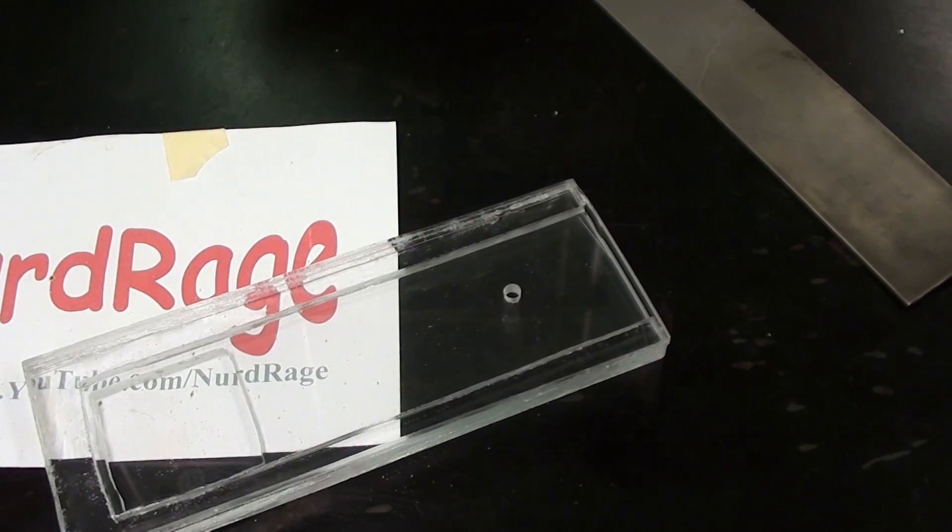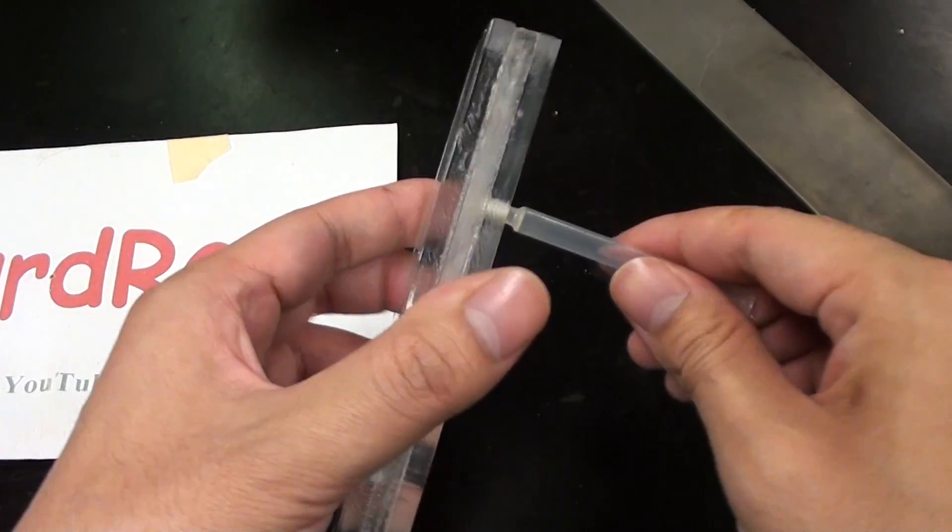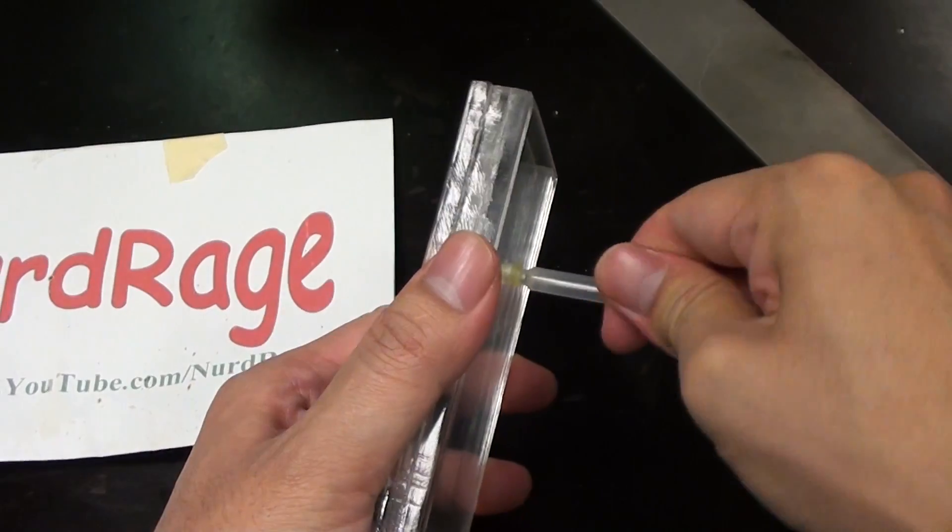Okay, back to the compartment. I've drilled a hole in the back so we can insert a tube. This will allow us to siphon off products as they form during electrolysis.